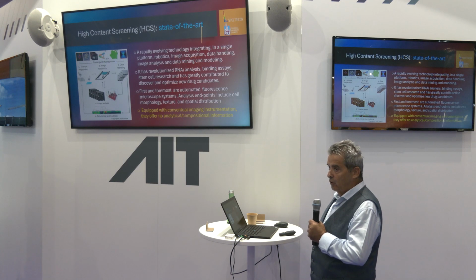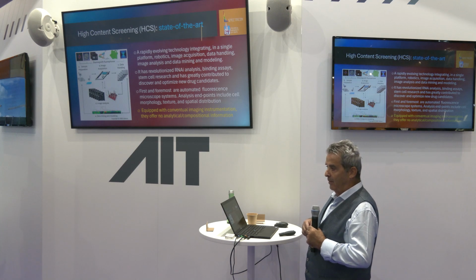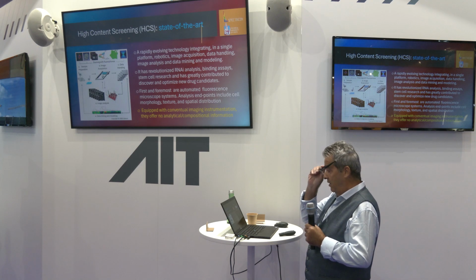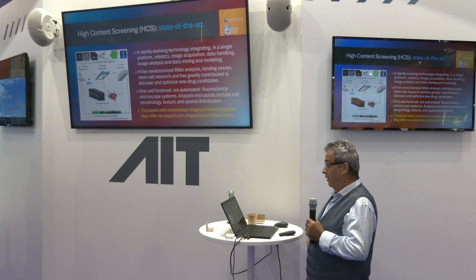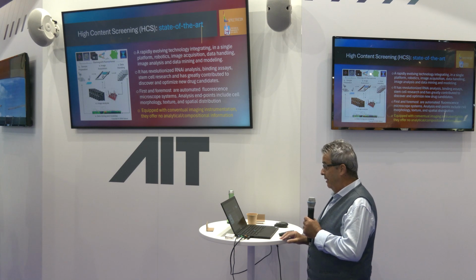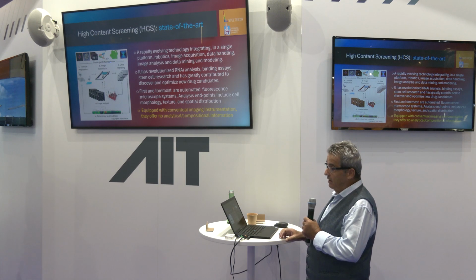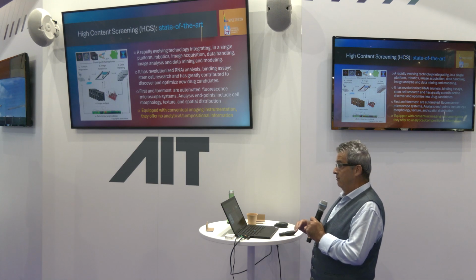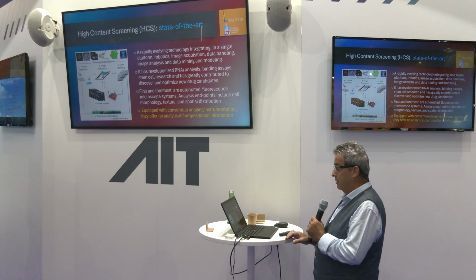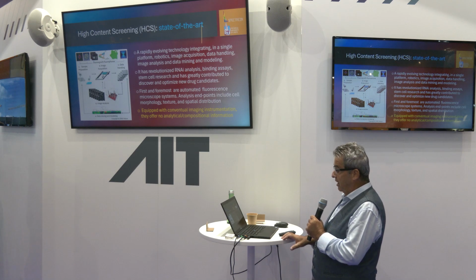For those that are not familiar with the field of high content or high throughput screening microscopy, this technology has played a very significant role over the years in molecular biology specifically, and it includes in a single platform imaging modalities, robotics, image acquisition, data handling, and so on, and has revolutionized several fields in molecular biology and towards developing new drugs and new diagnostic and treatment methods.